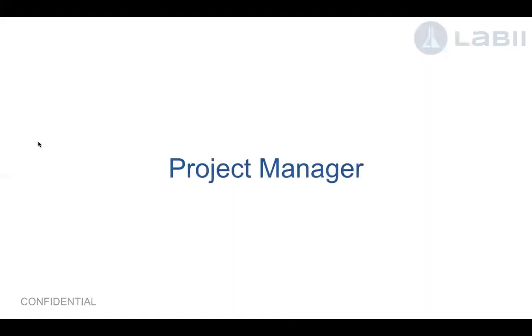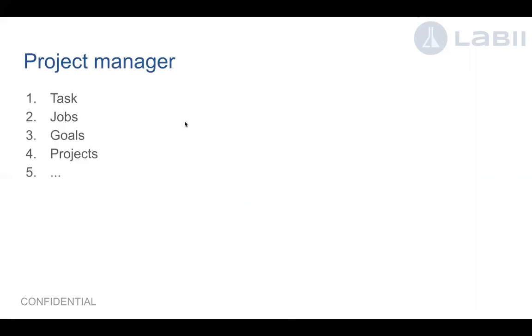And then the other one, actually, Labii can go further and be used as a project manager. For example, if you have a lot of tasks, many jobs can be created, goals can be created, projects can be created. This can all be linked together.